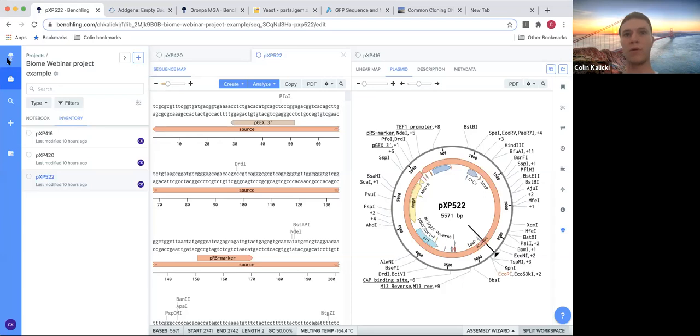And if you remember from previous webinars, or if you've ever done anything in the lab, fluorescence is used all the time to tag things, to look at how much of something you have. It's really cool. So you want things to fluoresce. However, today we're going to be looking at yeast, specifically baker's yeast. The Latin name I cannot pronounce, but if you look up baker's yeast, you can find it and try that tongue twister out for yourself. And we're going to be looking to transform baker's yeast in order to produce this green fluorescent protein.